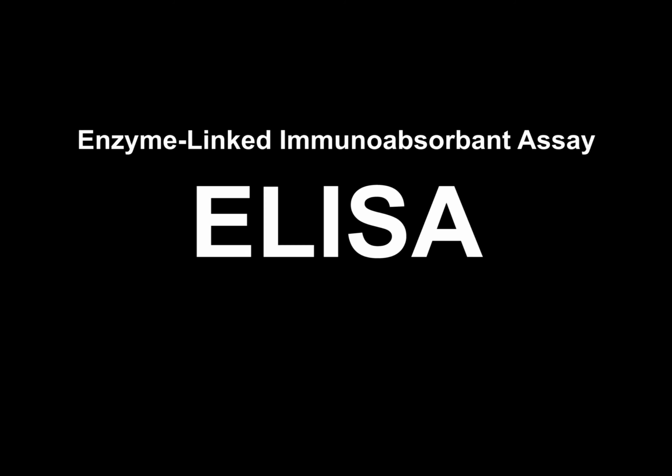Hey guys, so today we're going to be talking about the enzyme-linked immunosorbent assay, also known as ELISA. This is a process by which we can determine the presence of antigens or antibodies through the use of fluorescent enzymes. There are two methods that we're going to look at today, direct and indirect ELISA. So let's start out with direct ELISA.